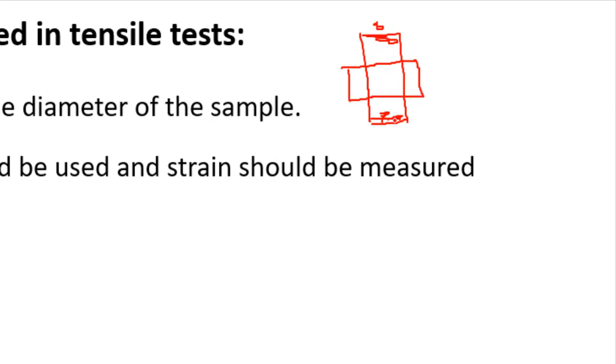not at these ends. And for that we need to apply extensometer or we need to apply a laser method to measure the strain in this part of the specimen, only in the middle of the specimen, avoiding the clamping stress.